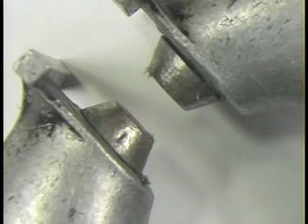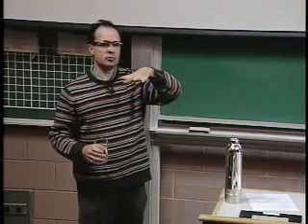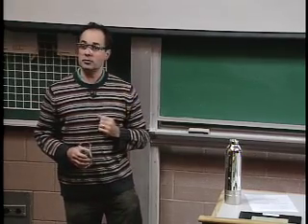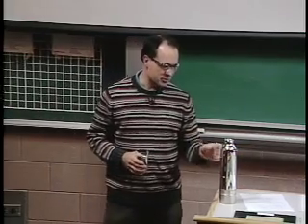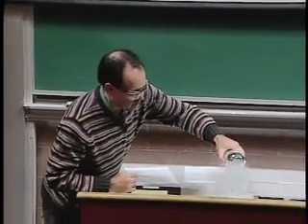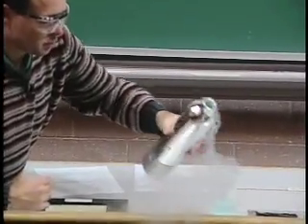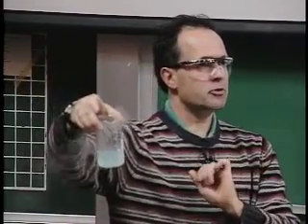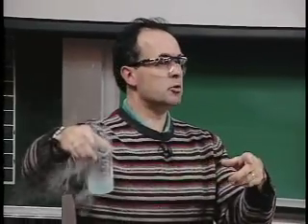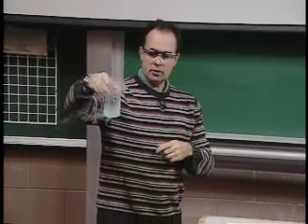Now we have liquid oxygen. I made this by putting a copper tube inside a flask, filling up the flask with liquid nitrogen, and then blowing oxygen through the tube. Oxygen has a higher boiling point than nitrogen, so you can condense gas-phase oxygen into liquid oxygen by pushing it through liquid nitrogen. I'll put some in a beaker so you can see it — it's got a lovely blue color. It's blue because of the electronic transitions going on in here. It's actually a very complex process — one photon exciting two electrons at the same time. The absorption of radiation is in the red, yellow, and green portions of the spectrum, and that leaves the blue for you to see. It's absorbing everything else.